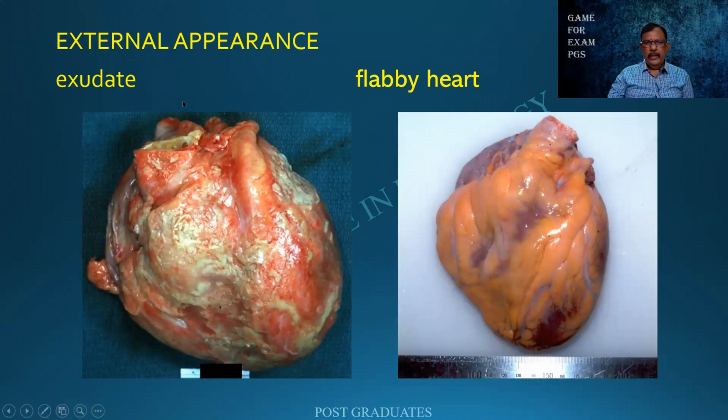So this is a heart in which I am finding yellowish white or yellowish gray exudate as patches. Obviously, it is a kind of purulent exudate. That is why great care must be taken when we open the outer layer of the pericardium, aspirate the pericardial fluid, and send it for culture. Sometimes you find that the heart itself is very loose. It collapses. We call it a flabby heart. It can be in a case of diphtheria, where there is a defect in carnitine, a cofactor, that is formed in the case of diphtheria.